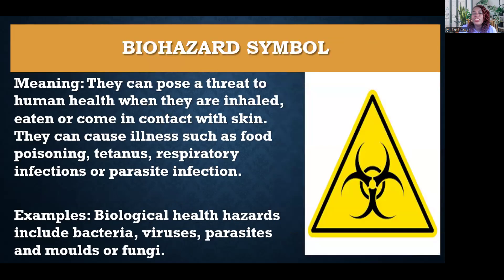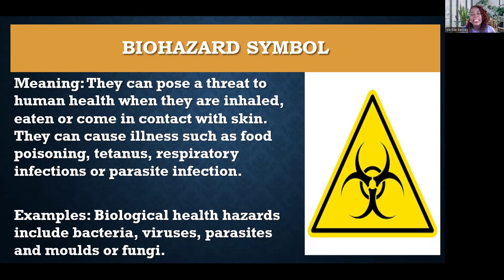The next symbol is the biohazard symbol — it's a circle with three other circles around it. It means that these substances can pose a threat to human life when inhaled, ingested, or when they come in contact with skin. They can cause illnesses such as food poisoning, tetanus, respiratory infection, and parasite infection. Take note, those of you that like eating in the lab — don't eat in the lab. Examples of biological health hazards include bacteria, viruses, parasites, and fungi.